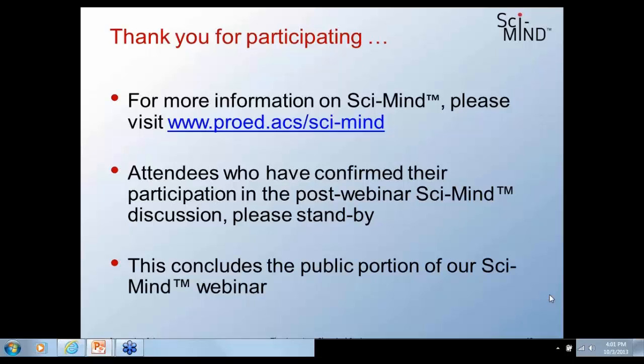Because we don't inject pure materials on our chromatographic systems, but we do usually inject clean materials. So I'm going to think about if I can remove some of that bulk matrix component that's probably interfering with some of the analytes and get that out of the way before I do my chromatography. I'm going to think about that.